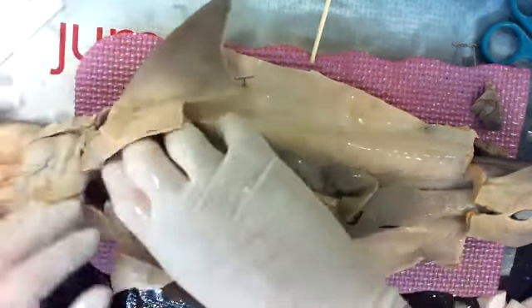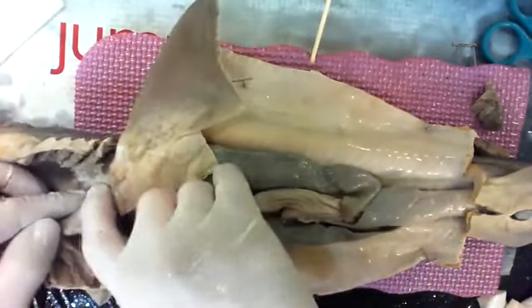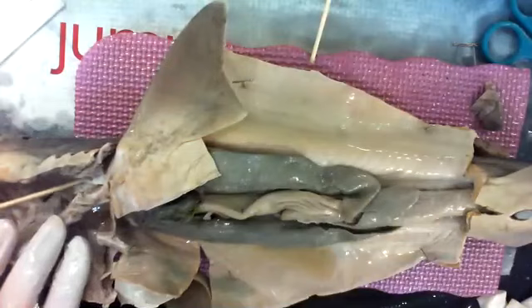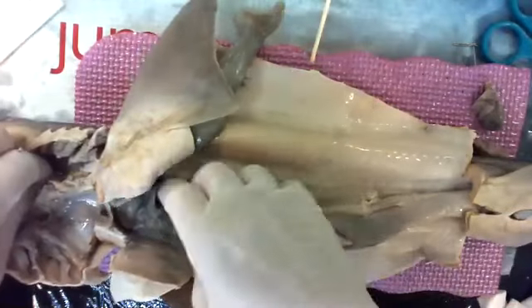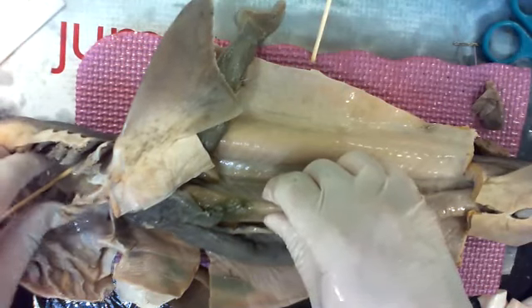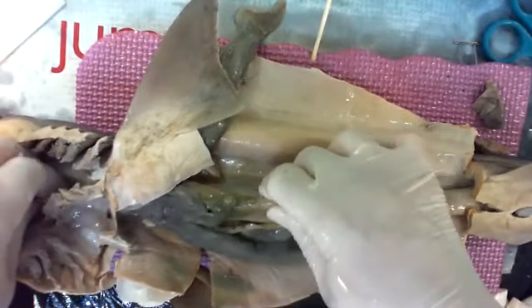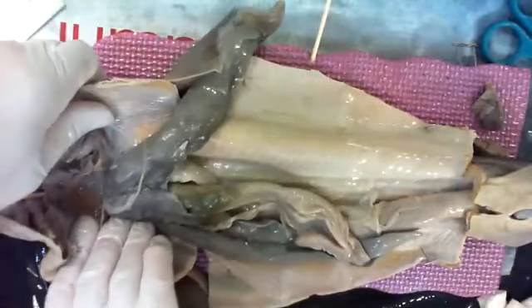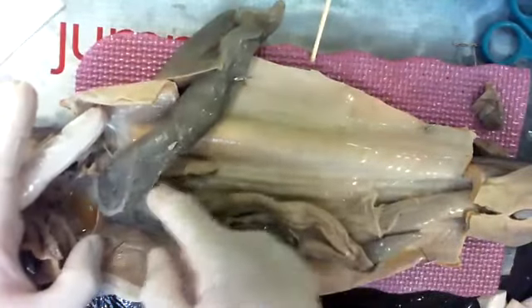Organs. So we just saw in the mouth, we saw the esophagus. If you want to take the blunt side of your probe, kind of wiggle it in. Feel it here. I'm pulling this back because I think it was going to vomit. Remember how I told you that sharks can actually turn their stomach inside out to vomit? I think it was in the process of vomiting when it died. It's like, oh, never mind, I'm dead. Pop that open a little bit more. All right. So this is in the mouth. I'm going to try and find that down in here.